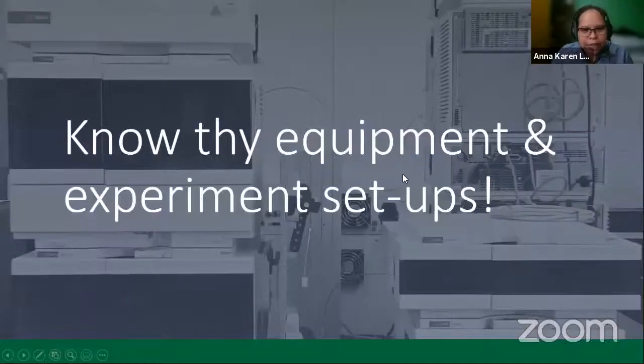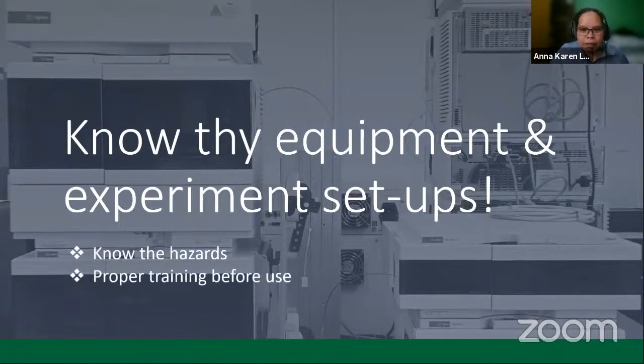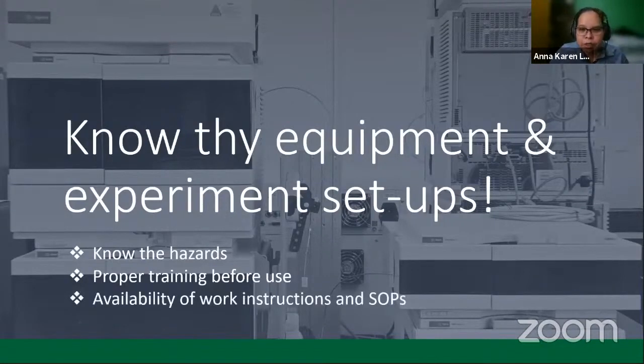Okay, so aside from knowing your chemicals, you also have to know the equipment and the experiment setups that you are going to work with. This will include knowing the hazards of the equipment and your experiment setups, the training needed before use, and the availability of work instructions and SOPs.